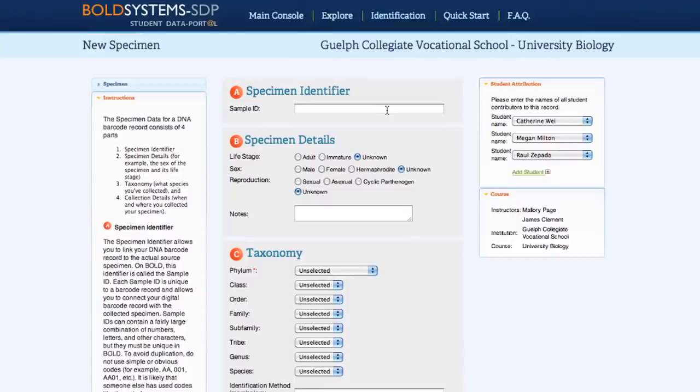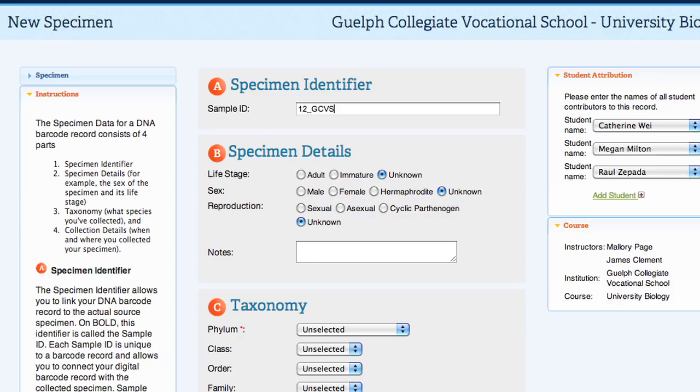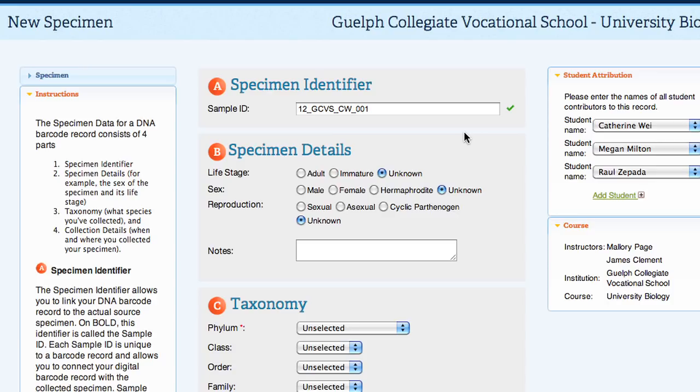The next step is creating a sample ID. Sample ID is very important — it has to be unique on BOLD, and it's important to keep it consistent for easy identification. For example, the sample ID 12-GCVS-CW-001 contains the year it was collected, the initials of the school, the initials of the student, and a sample number.